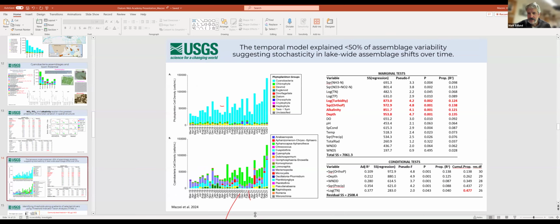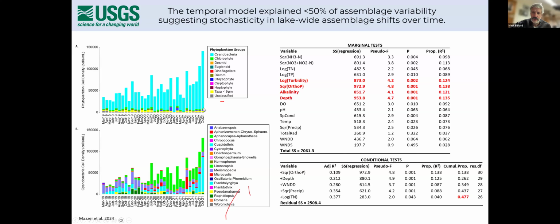Last question I had on my list was how is your toxin analysis done? Is it ELISA, HPLC? What's the strategy down there? So we do ELISA as the quickest one, and I'm not doing the toxin analysis myself here. Those are done at the Kansas Water Science Center by Keith Lofton's lab. They're the chemistry folks.